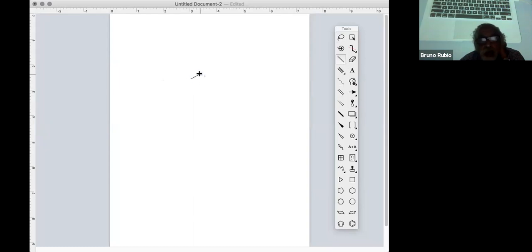So what I'm going to do is, see, I'm drawing a bond line structure. That little blue dot means it's going to create those bonds. And let's say I want to show dashing and wedging here. So I selected the wedge tool. Here it is. Select the wedge tool, and I wedge it down like that. And now I want to select the dash tool. There it is. There are two different dash tools here. And so something like this.